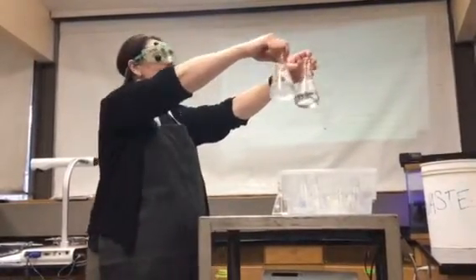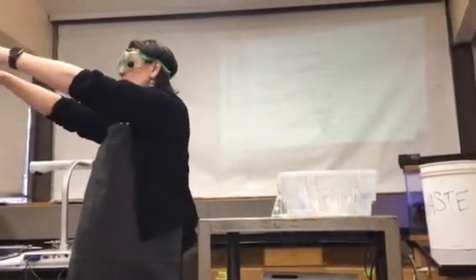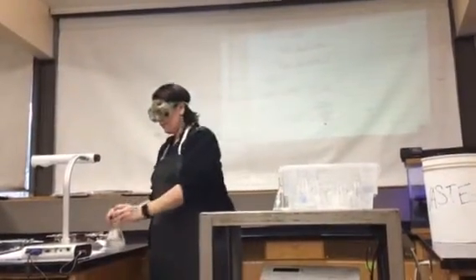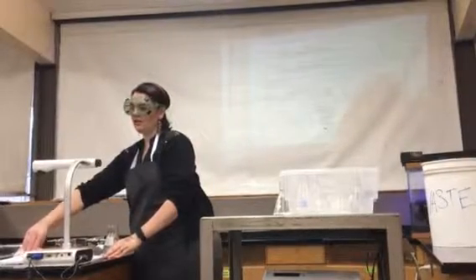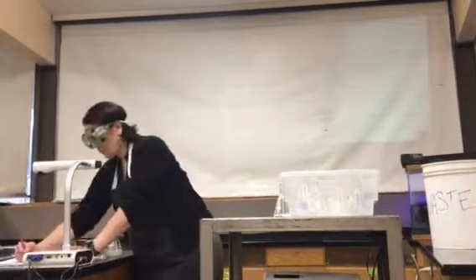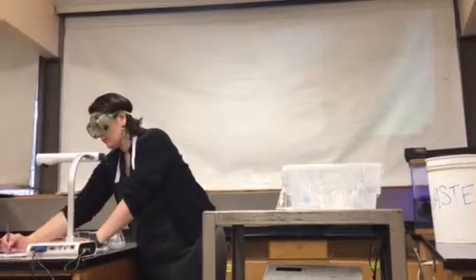D and E. Please write your observations about D and E in your notebook. I heard that it looks like coconut water. Is that what somebody's saying? I'm gonna turn my page because I'm running out of space. Can you handle that? Wait, the one that's like darker colored, is it D or E? The darker one is E.